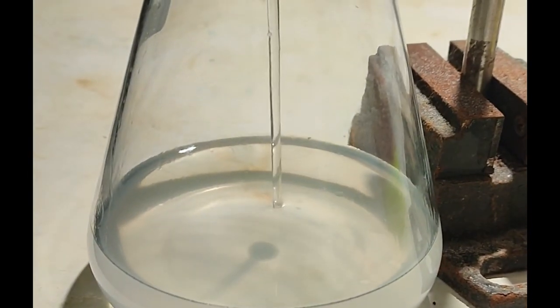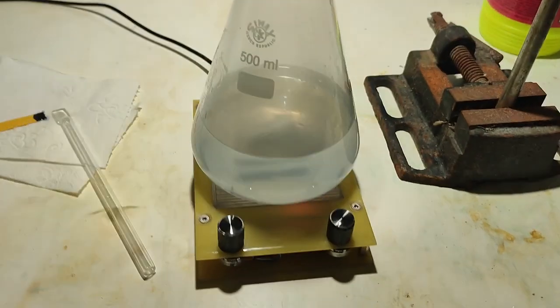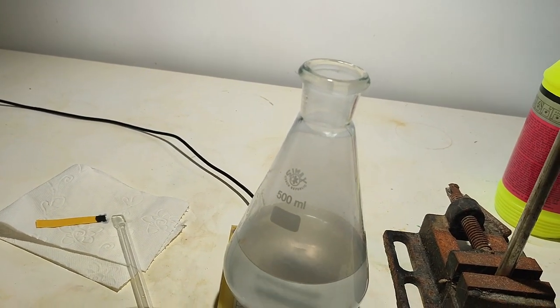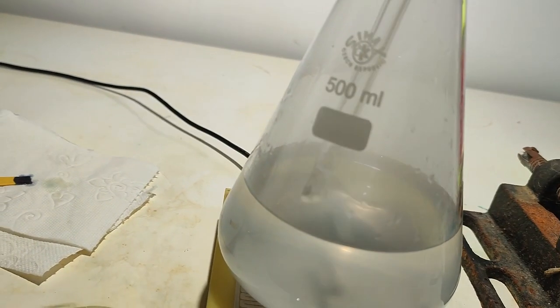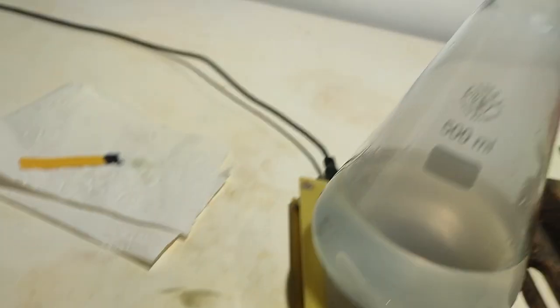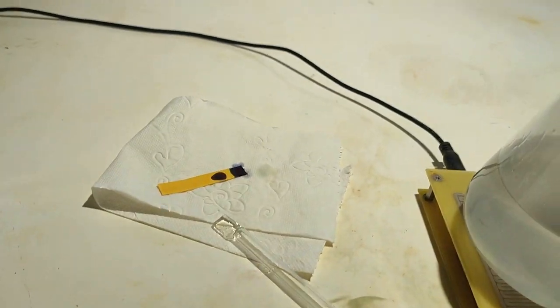Wait. Okay, so I'm acidifying the sodium methacrylate and sodium hydroxide. As you can see, it generates a little bit of smoke when I pour it in, but this is mainly from the hydrochloric acid fumes. And I'm checking pH, but let me... oh man. Anyway, let's check pH. Still alkaline.